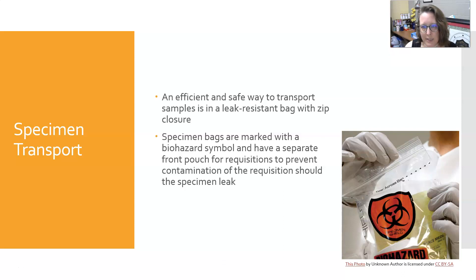An efficient and safe way to transport samples is going to be in a leak-resistant bag with zip closure. The specimen bags are marked with a biohazard symbol and they have a separate front pouch for the requisitions to prevent contamination of the requisition should the specimen leak. You really do not want a wet requisition, so use that front pouch to put the paperwork there.